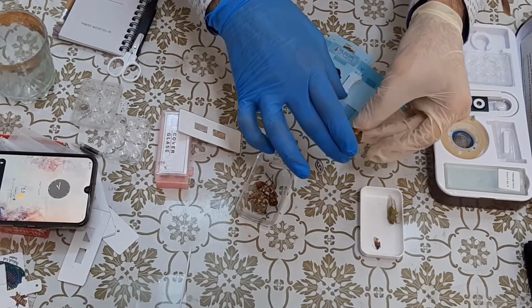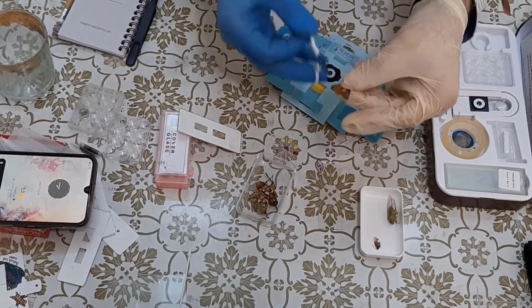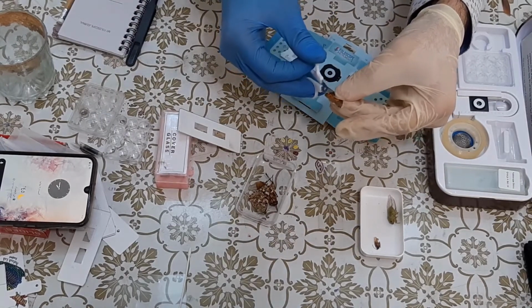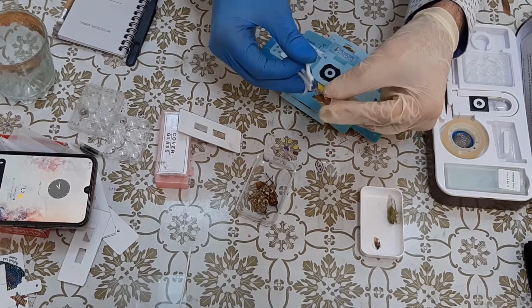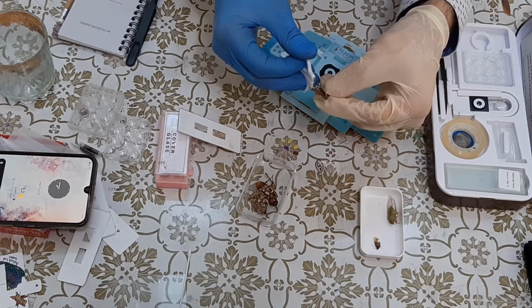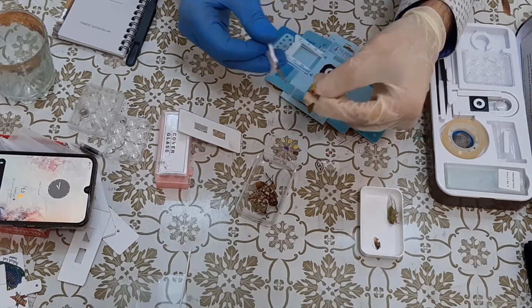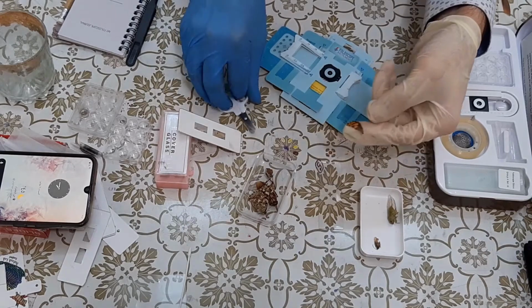I guess this one's too much, so I'm going to make it two pieces to control the sample.